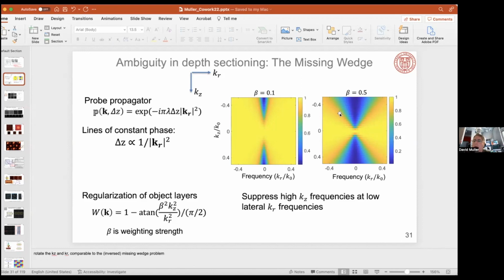When you go to ptychography, maybe I can get plus or minus 10 degrees or plus or minus 15 degrees. And then this would be my wedge shape. And so what it tells you is that if I want to do a 3D reconstruction, I've got all these propeller blades, and I have to put my next propeller blade touching the first one. And so what it lets me do is increase the step size between slices. And it does so in a way without interfering with Crowther's criterion. Crowther's criterion would tell me if I had a bigger object, I needed more slices.